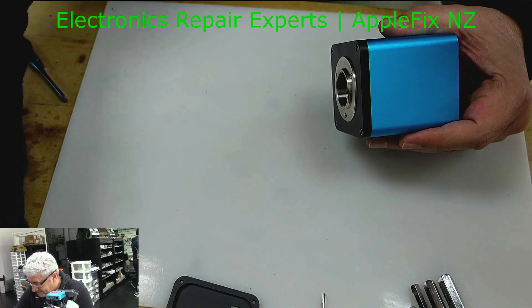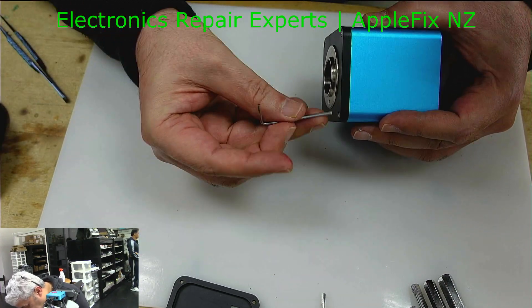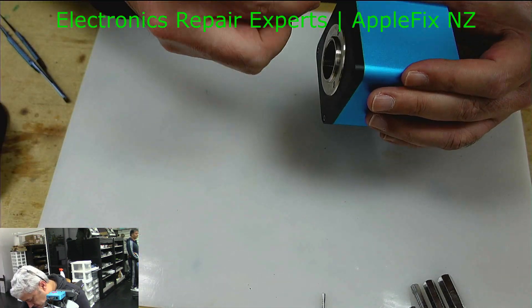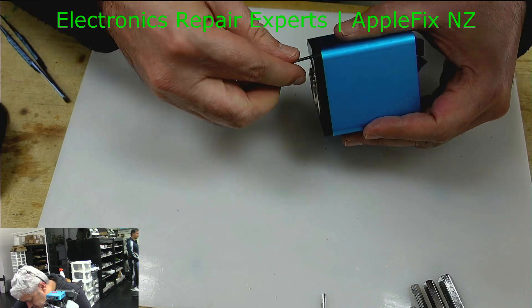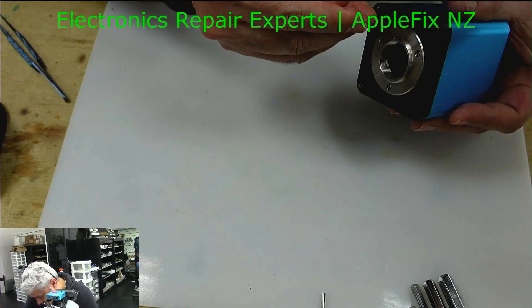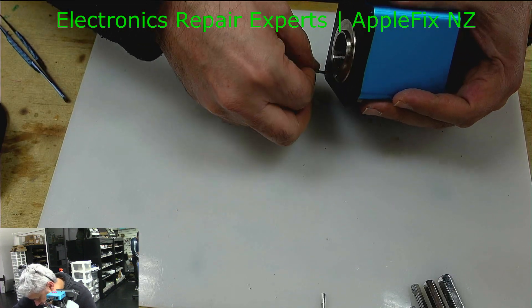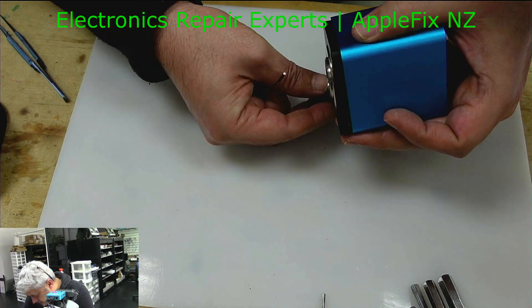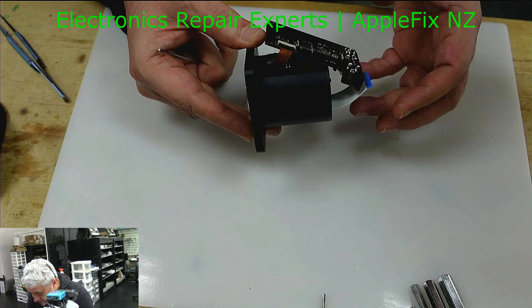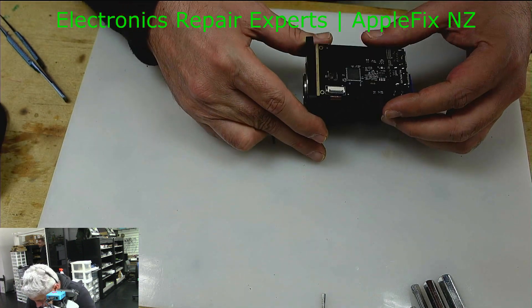Looks like there is another cable holding it, so I think I have to remove this side as well. This is the AF lens — I didn't actually want to open it from here because lens settings, if they are out, are very hard to fix. But if this is the only way to open it, we have to go this way unfortunately. Okay, there you go — the whole thing came out. This is the only board I find here.